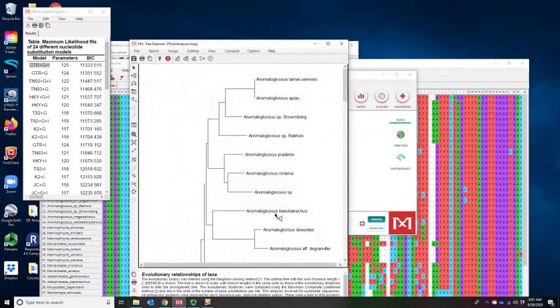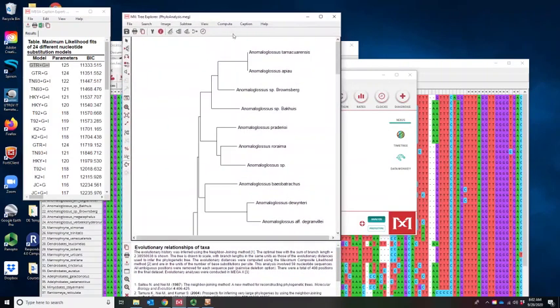Now, neighbor joining analyses are very quick, and other analyses will be rather quick for this one too, because it's again a medium-ish, but fairly small data set. And once you do analyses, it opens up this Tree Explorer window, it calls it. And there are different tools we can use here. I'm going to show you the different tools, and then we're going to do some side-by-side comparisons. Okay, so let's just scan over the results and see if anything jumps out at us.